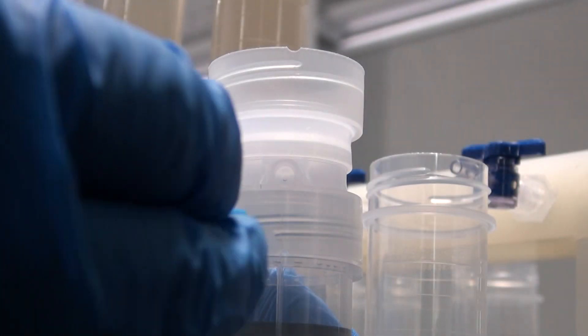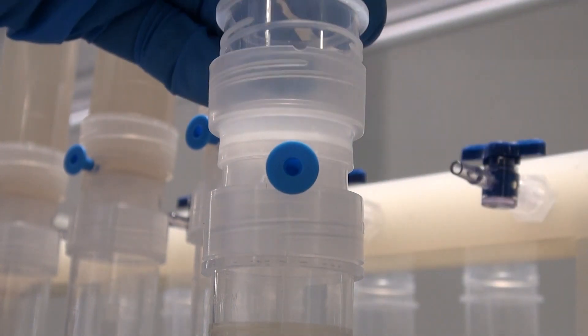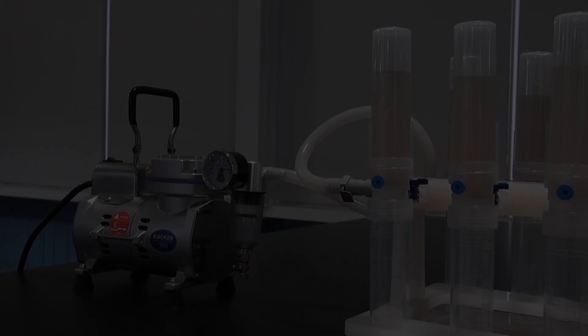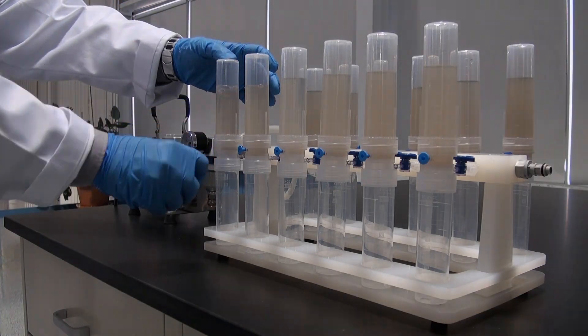A 4-position manifold is also available and they may be connected together in order to filter more samples simultaneously. The vacuum pump creates suction within the assembly to quickly filter particulates from the samples.